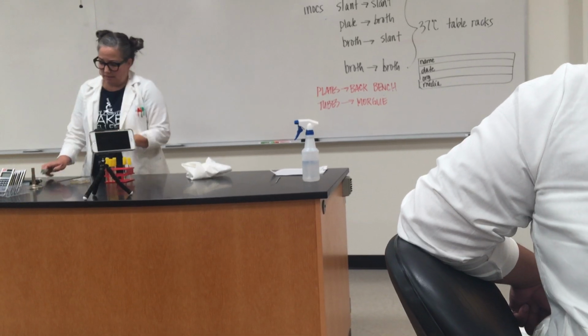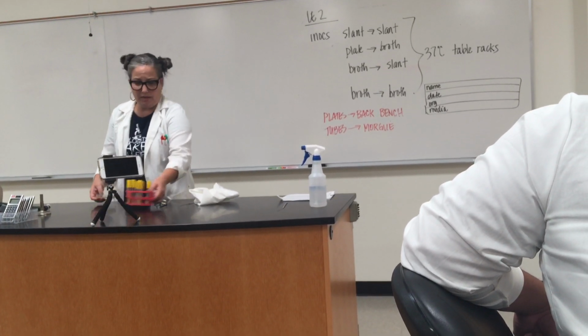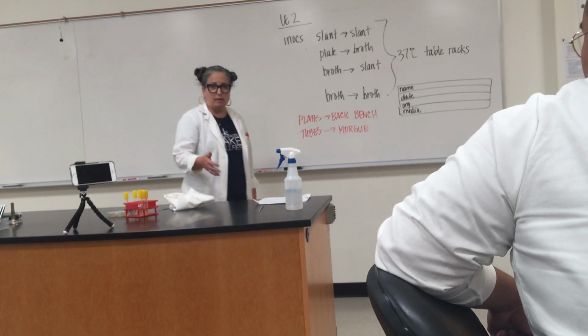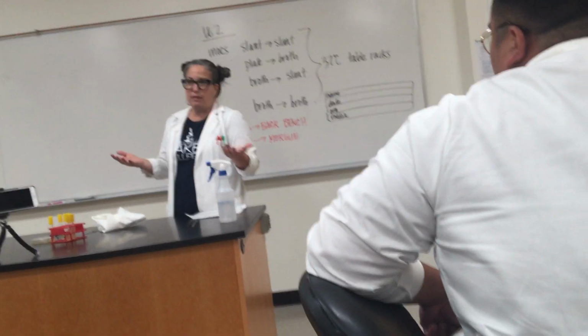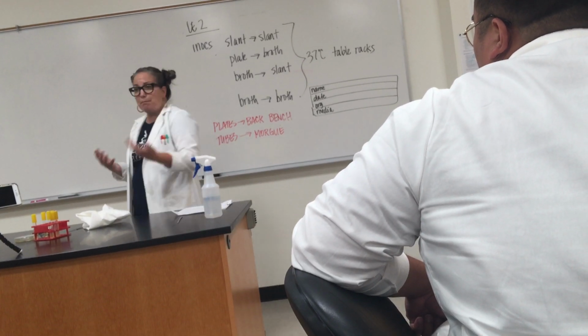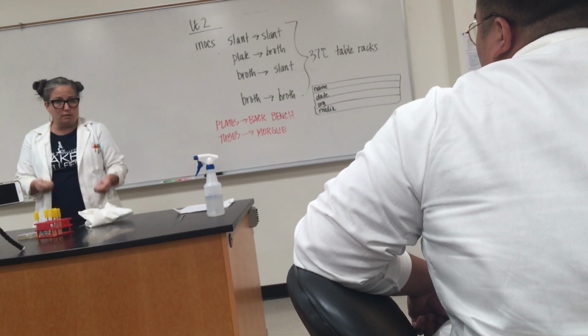To work aseptically does not mean to work sterilely, which always freaks everyone out, right? But, I mean, you know that when you have surgery, it's not sterile either, right? Are you sterile when you have surgery? No. Even when they rub you down with betadine, you're not sterile, right? Nothing is sterile. The people that walk into the room are not sterile. What they are doing is aseptic surgery using sterile tools, and that is exactly what you're going to be doing.